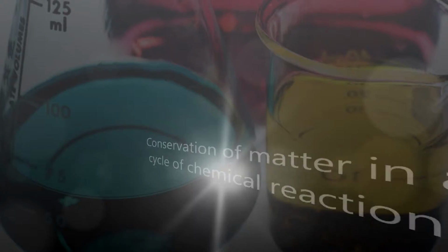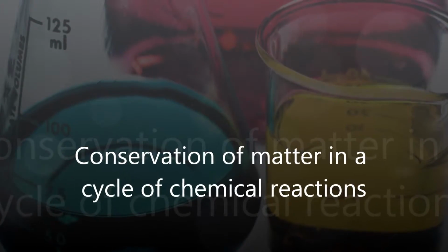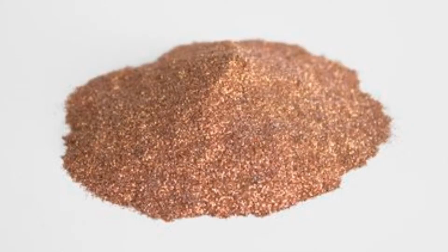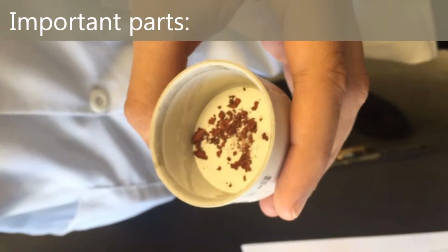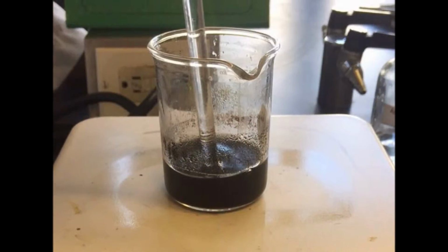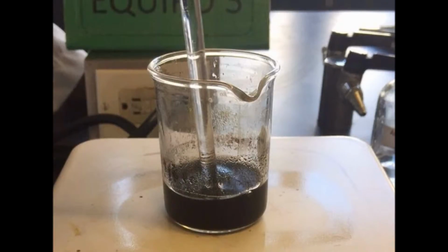The conservation of matter in a cycle of chemical reactions consists of a cycle of reactions whose objective is to prove matter conservation. To start the experiment, we have metallic copper with a series of reactions. We obtain different compounds, and at the end of the cycle we regain metallic copper and it should weigh the same as at the beginning. The important part is to prevent the loss of any product or byproduct during the reaction cycle and that the reactions are made in order and with established amounts in the experiment.